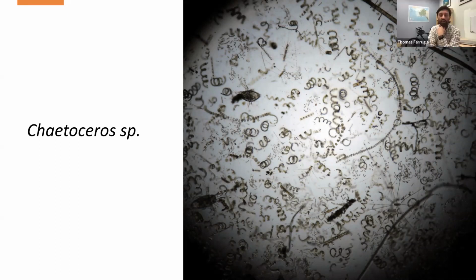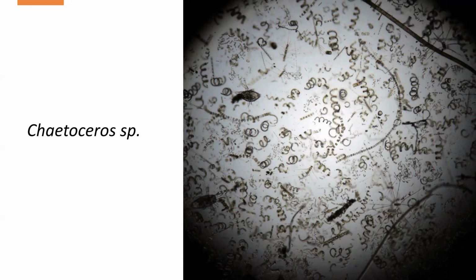That's great. Yeah, thanks, Dean. Quick follow-up on that. If somebody doesn't have access to a microscope, but they see something in the water, is it good enough to just take an empty water bottle and fill it up with seawater and then contact somebody to try to get it to them? Or is it more involved than that, like fill it up with seawater, put it in your refrigerator until you can contact somebody and try to do a next day shipment or whatever?